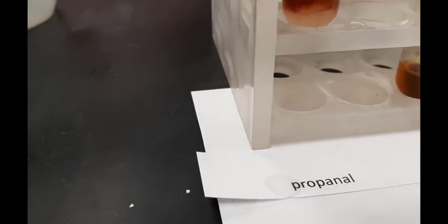Here you see me adding just enough of the sodium hydroxide solution to get most of the brown color of the iodine to dissolve. And I have to mix that to keep separate layers from forming. And still there is some, but there's enough mixing for there not to be a problem. And then I'm going to take each of these solutions and put them in a hot water bath once I've accomplished this.